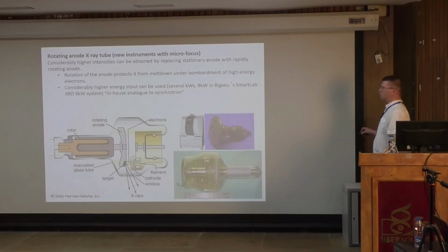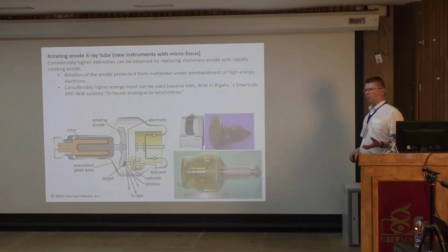Now it's not shooting in one particular place, it will shoot a radial area here. If you look carefully, maybe you can see a lighter area in here. That is where the X-rays have been shot. This allows much higher power, because the anode tolerates more power. If we do a rotation, the X-rays are, as earlier, created 90 degrees from the direction of the electrons.